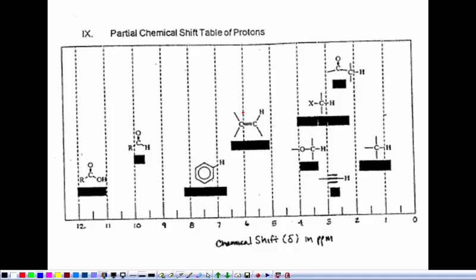If the peak position changed as a function of magnet, we wouldn't be able to use stuff from 20 years ago, and we wouldn't be able to use what we have now 20 years from now. Because we're taking a ratio, the chemical shifts will stay the same in the future. So all these tables are still valid. That's the important thing. I would have given the people the Nobel Prize just for thinking that far in advance.